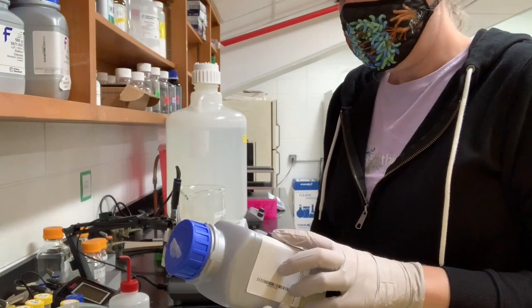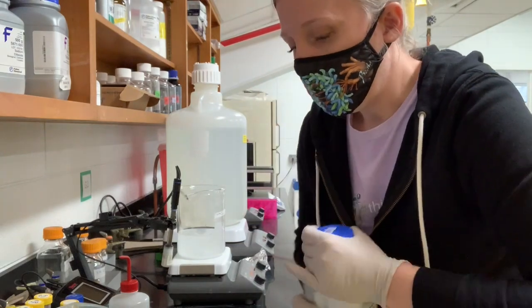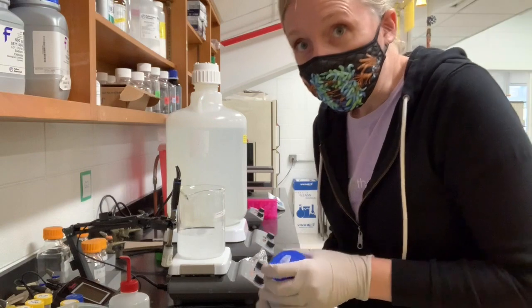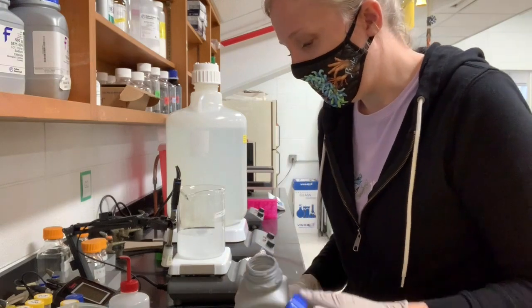The protocol may say KCl, so another good thing to do is just make sure the bottles all have the chemical name that you're expecting. And when you're looking for the molecular weight, be extra careful that you grab the right bottle. I'll show you something that's going to be a little tricky with the next two.